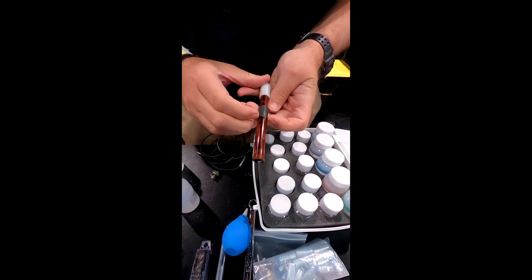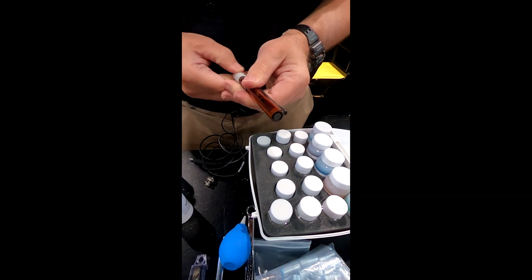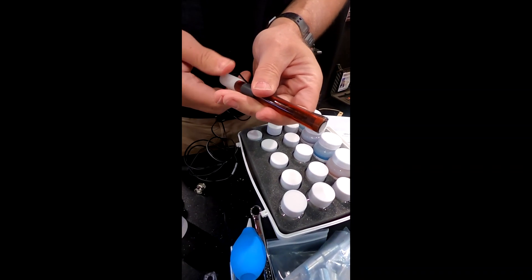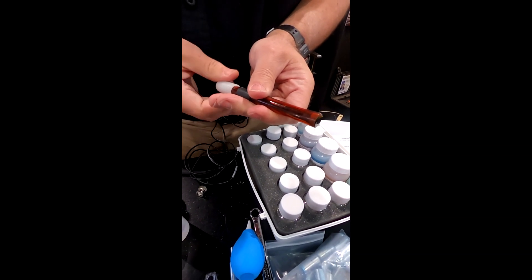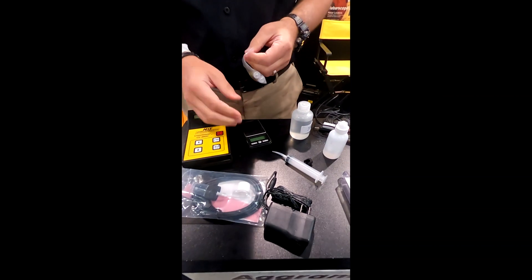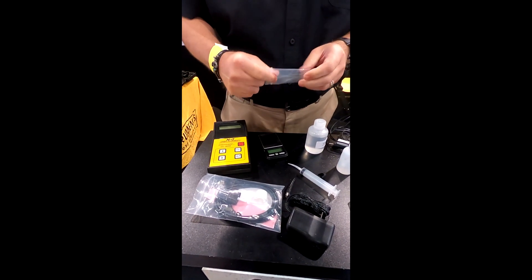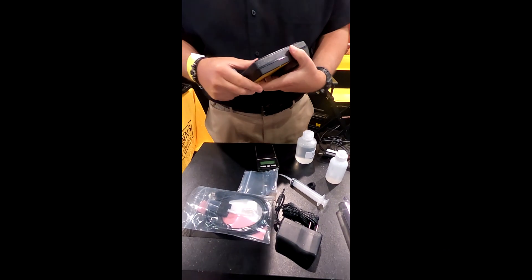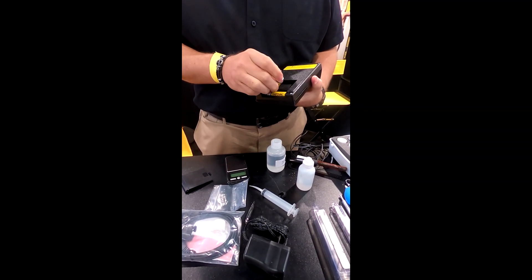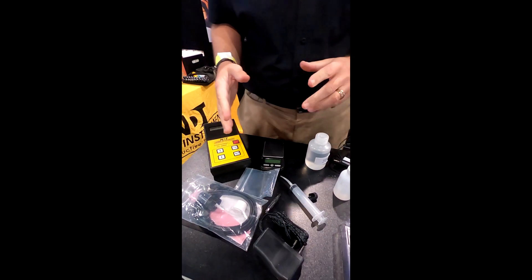Just remember that the hole to fill it is typically behind the rubber. By pumping it like this, you should get it around the outside of the electrode, then reseal the electrode back in there. The unit does come with some batteries, and it also comes with a power supply if you run out of battery power. When you're not using a piece of equipment like this that you'll probably use intermittently, it's always a good idea to remove the batteries.